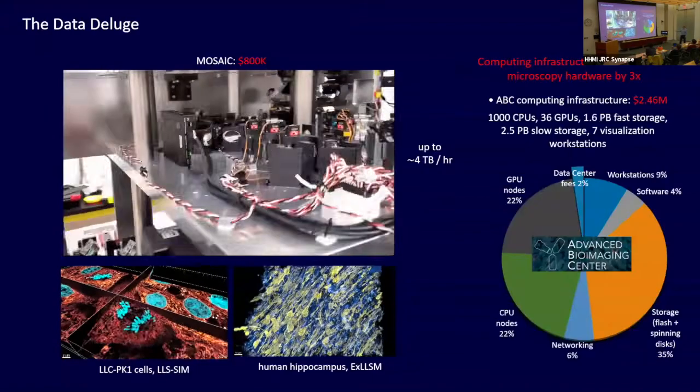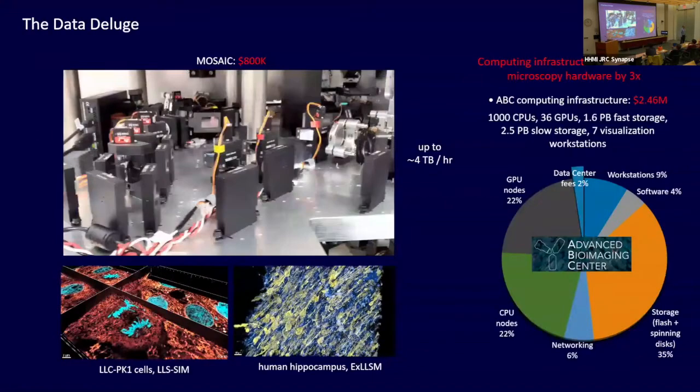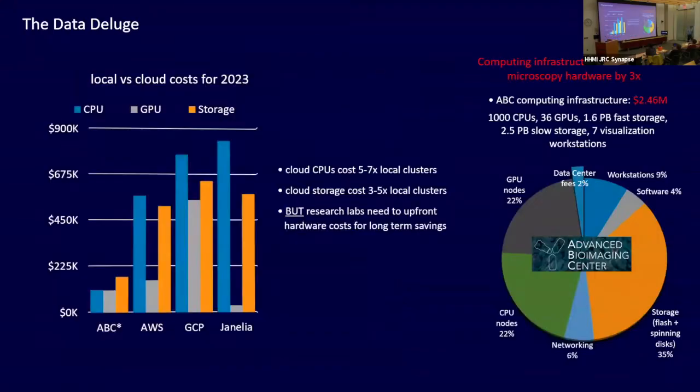Not many academic groups have the resources to do this kind of thing. Not even many imaging cores have the resources to be able to do that. And for us, we had to be vertically integrated in this because we couldn't afford even to go on the cloud. We needed a solution that for us would do what the cloud would do, but do it locally. But the problem is all this stuff depreciates really fast. There's a new generation of GPUs every 6 months, there's better hard drives every year. So we're burdened. This is a problem.